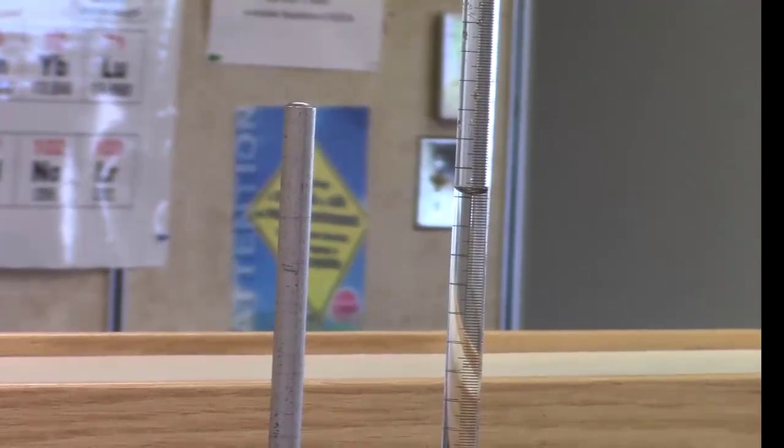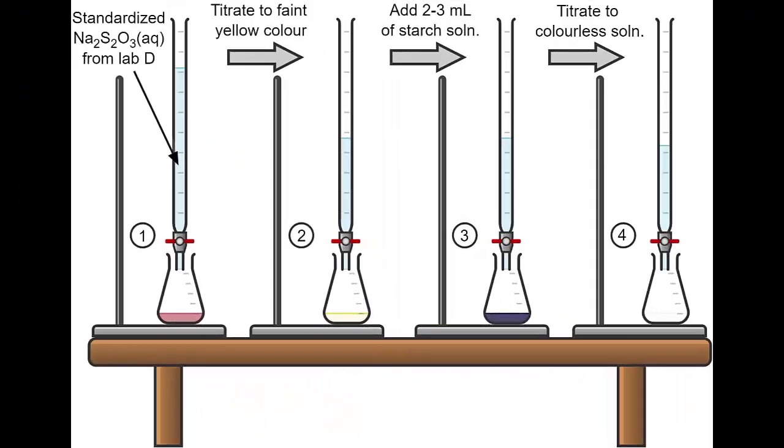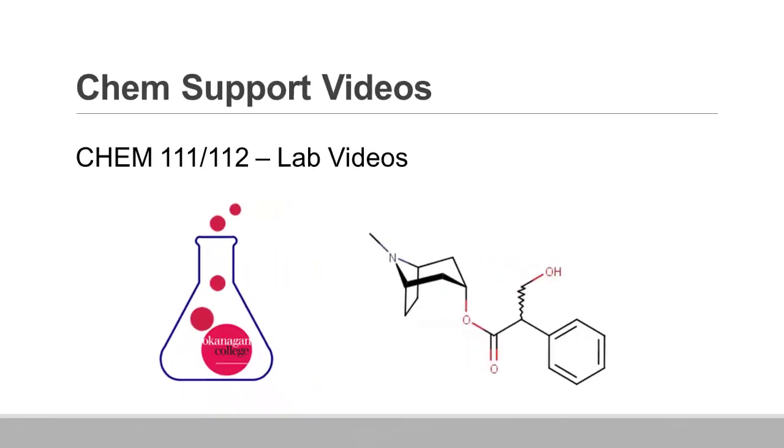The titration is repeated 3 more times for a total of 4 titrations, so that 3 of the titration volumes are within 0.25 mL. After watching this video, a complete set of titration data will be provided through a link in Moodle.